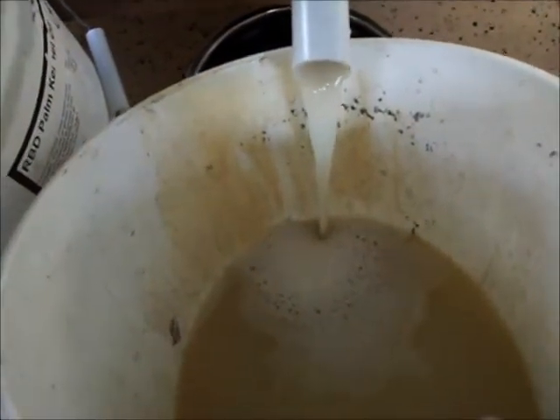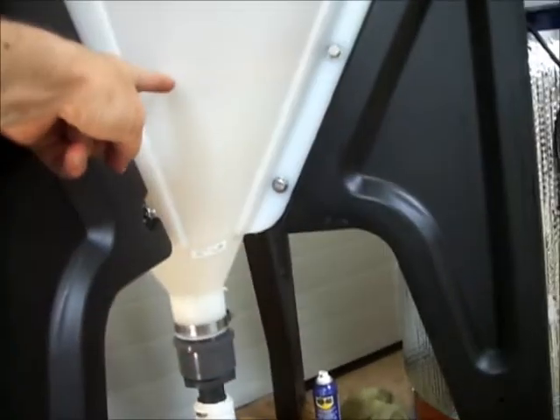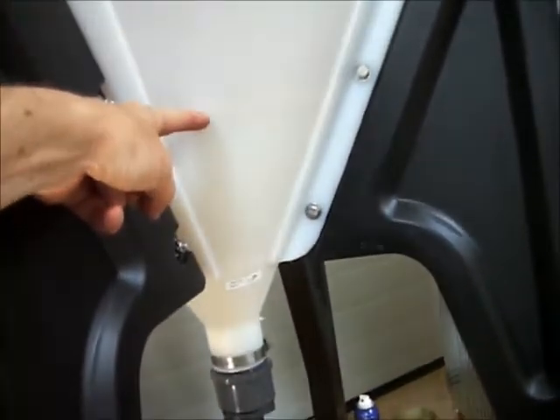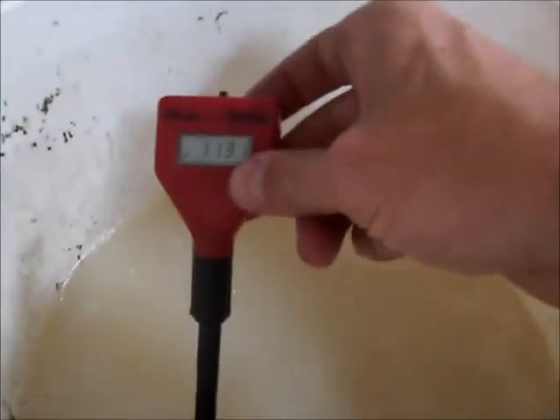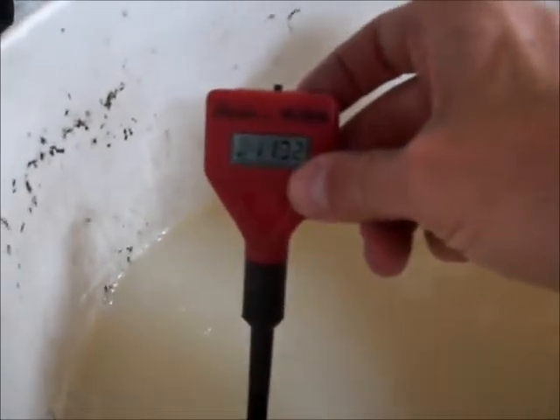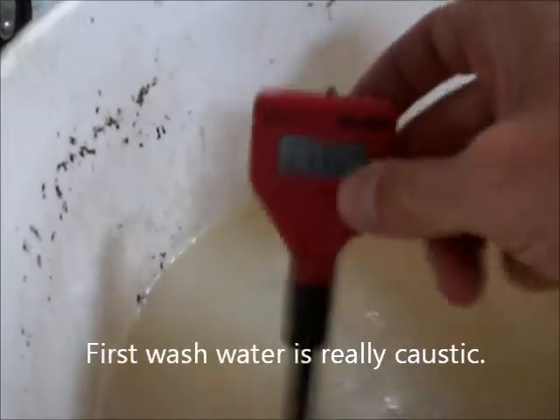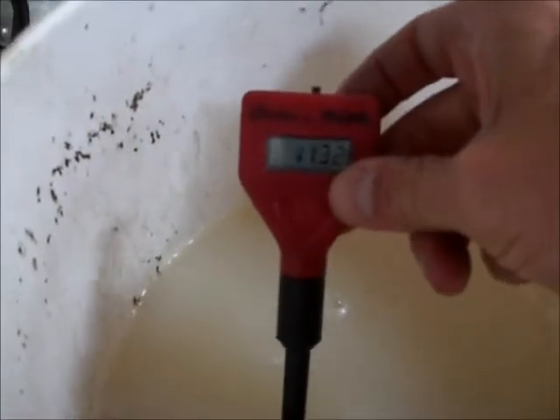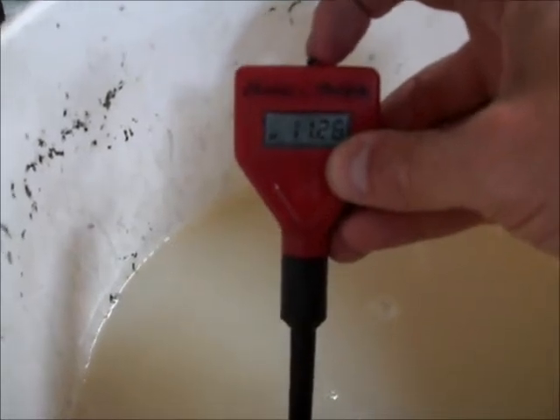There's the first wash water coming out and you can see it's pretty darn milky. We're still draining the wash water — the level is about right there, probably hard to see on film. We're going to stick the pH probe in there and see how bad it gets. As you can see it's pretty bad — 11.32 initially, so that's really alkaline. There's quite a bit of KOH coming out in there.